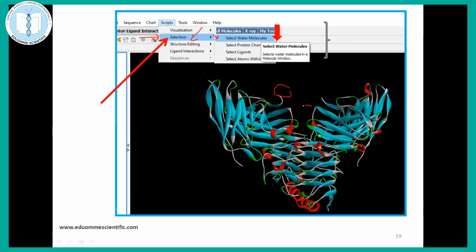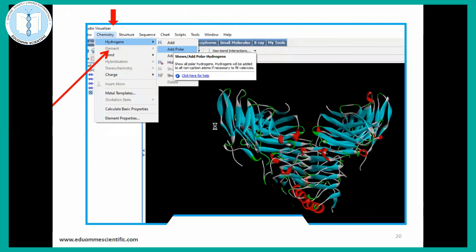and then delete these things. If you are seeing this water molecule, it should be removed prior, like sometime prior to docking and other kind of analysis. We have to remove these things.